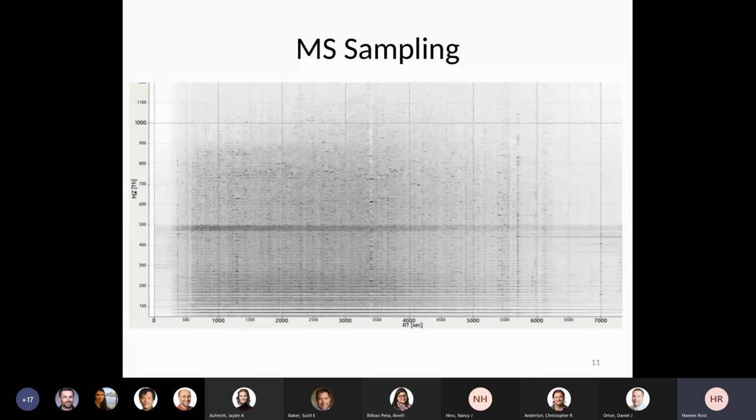And in shotgun proteomics or data-dependent acquisition, the mass spectrometer will decide online which precursors to sample, which leads to a very positive outcome, namely that the precursors and positions that are sampled will have high intensity and likely contain a fragmentable precursor analyte.